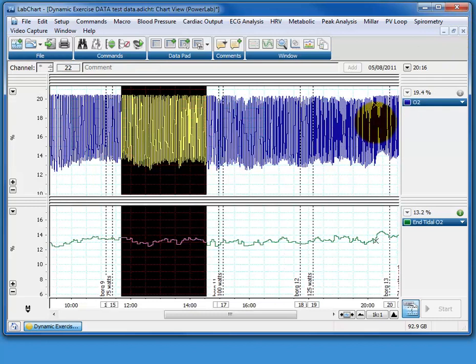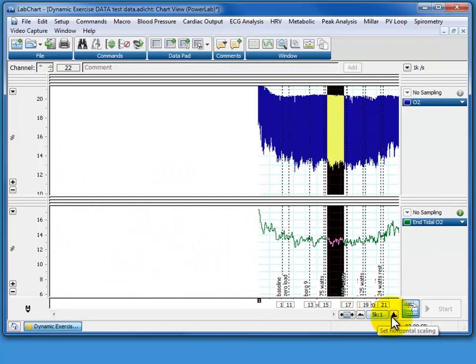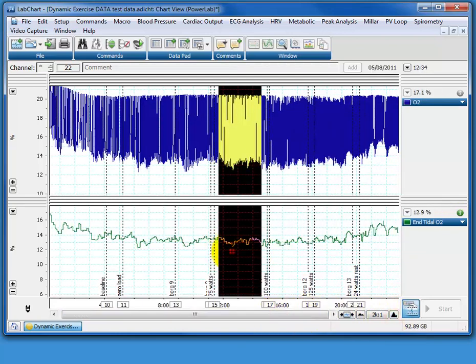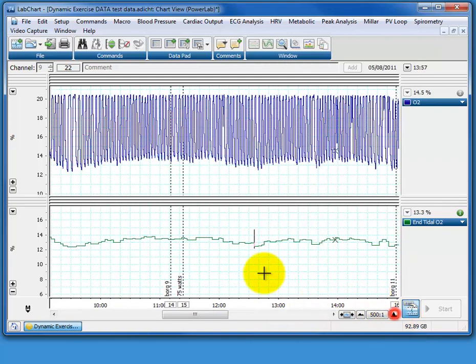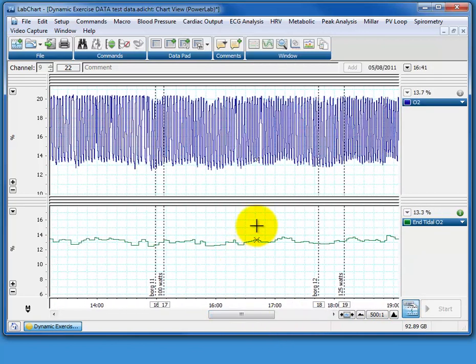Of course you can apply the same to pretty much any parameter by measuring cyclic maximum, means. You can measure pulse pressure from blood pressure values using the same add channel, and I would advise doing this. It does take a while maybe to do 5 or 6 of these in a row, but I would advise doing it simply because you can then look at these data and go, yep, the data look nice and clean, there is no strange spiky bits, there's no errors, and then you can select areas and take averages. So that's that.